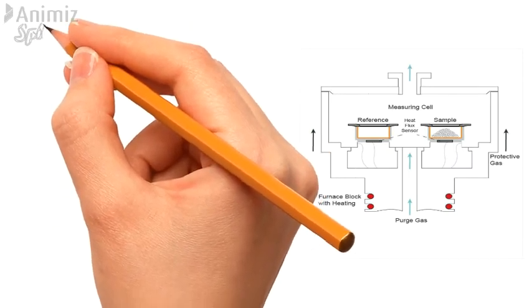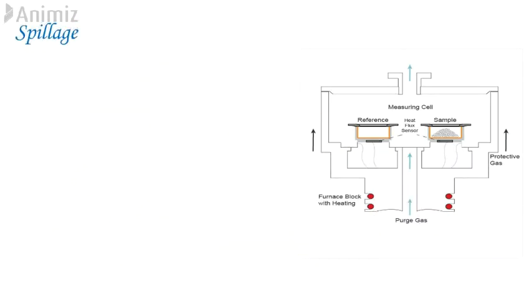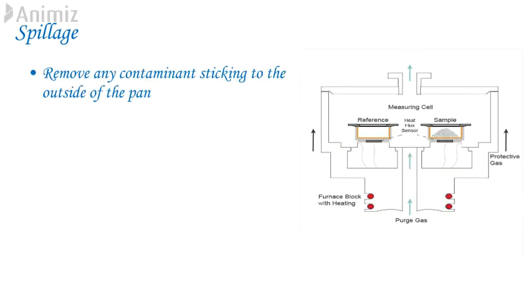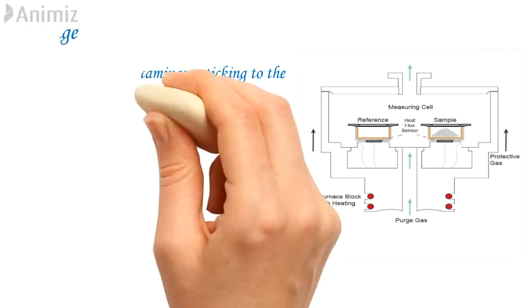9. Spillage. A frequent cause of contamination is from sample attaching to the outside of the pan. Check and remove any contaminant sticking to outside of the pan, particularly at the base of the pan.